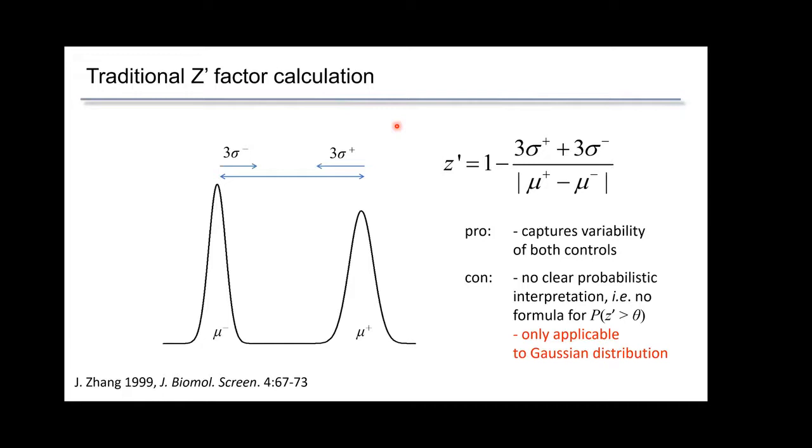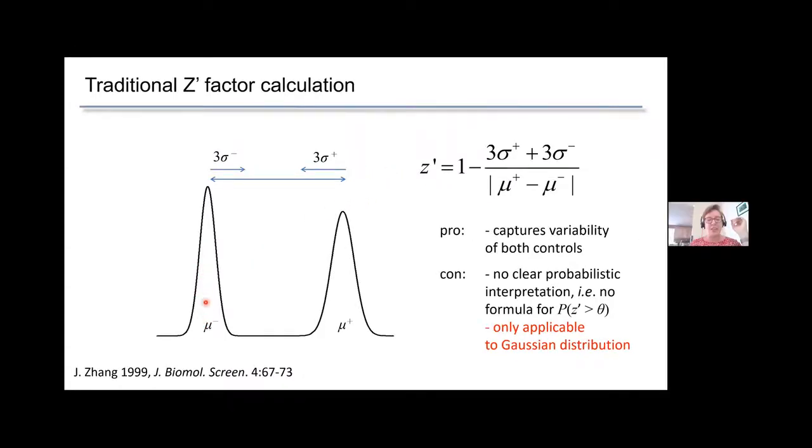It's a measurement of basically the statistical power to measure small changes from a compound and to register them as a screening hit. There's a formula for it, there's a wiki page for it. It's really based on the idea that you might have a negative control and a positive control, and the distributions are going to be as such, and that you want to have a good separation here between 3 sigma in either direction.